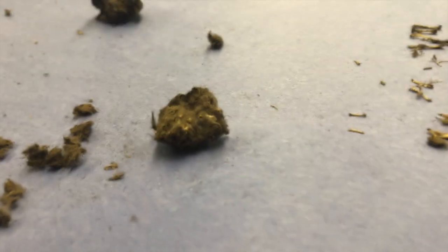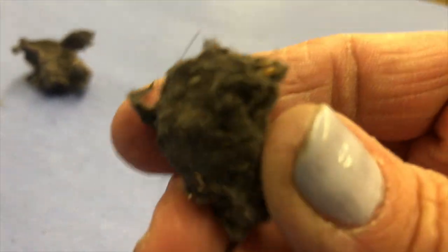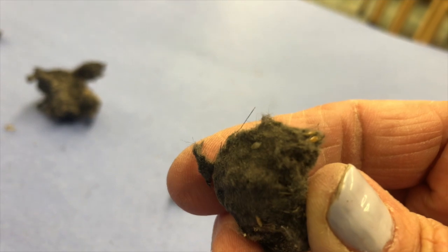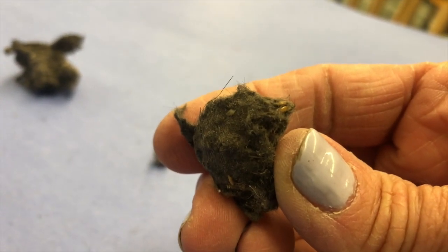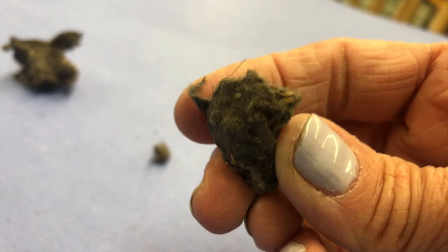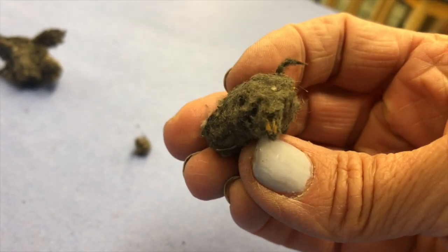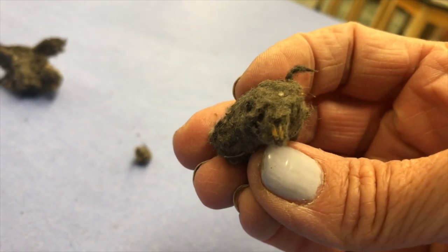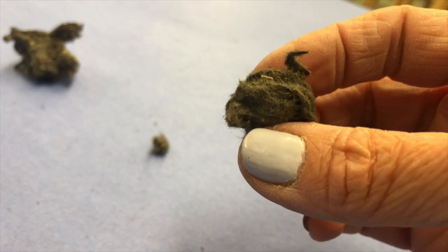If you find something like this, you see those little yellow pieces sticking out like that? Those are the front teeth of a rodent, a rat or a mouse. So I know that this is attached to the skull. So I'm going to carefully extract it from the fur.